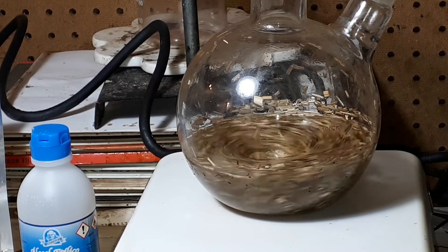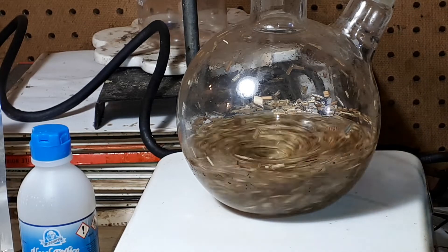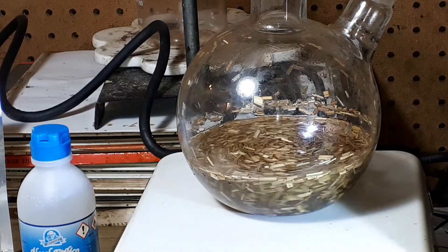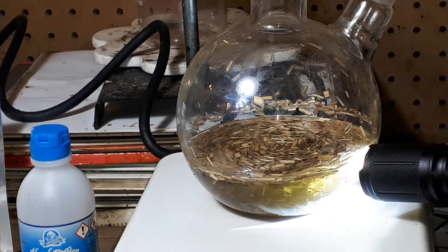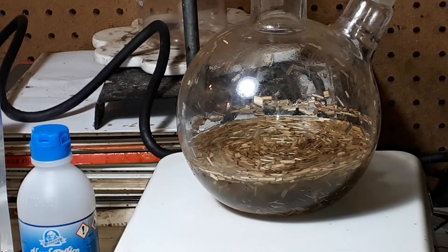Let's zoom in for a bit — this might be hard to see with this camera. I'm going to have to turn off the stirring. Can you see right there? That yellowish tinge is lemongrass content being extracted from the lemongrass in 95-96% ethanol.